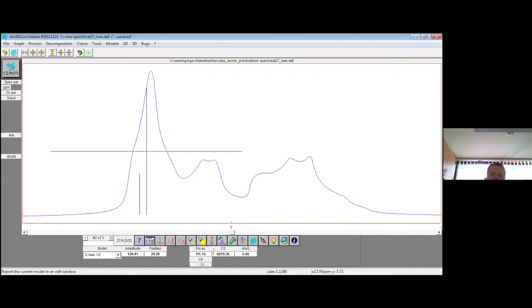For example, as I've shown you before, for carbons you can quite quickly assign different signals to different carbons in the molecule. But then proton spectra are very much overlapped. All these shifts are squeezed into a small chemical shift range. Then it's more difficult to say this proton signal belongs to these methyl protons, this belongs to a separate OH group, this belongs to something else.